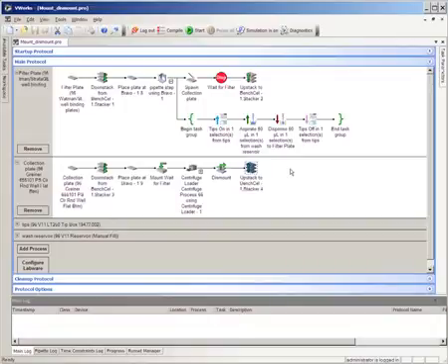For more information about the mount and dismount tasks, see the VWorks Automation Control User Guide.